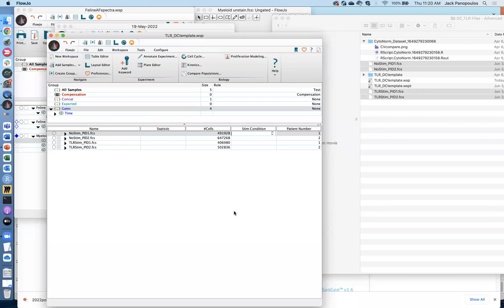So you're going to say, the samples that come from this freeze thaw tube, half of that sample I'm going to consider a replicate or test sample. The other half I'm going to use as a quote unquote control, because it represents the antigen expression for that particular tube at that particular time point. So it's rather tedious with respect to the controls it has to have, but that's essentially what you would have to put forward.